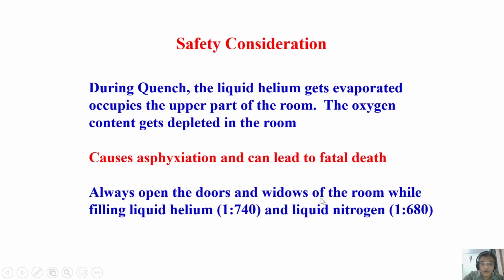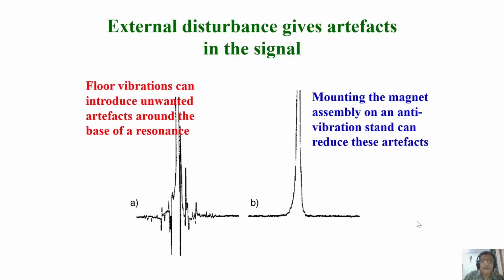Always open the doors and windows of the room while filling liquid helium and liquid nitrogen. Okay? Do not try to do the experiment by closing the doors and windows while filling the helium. If by some bad luck there's a quench, it can be very dangerous. So this is one of the safety warnings I'm giving you.